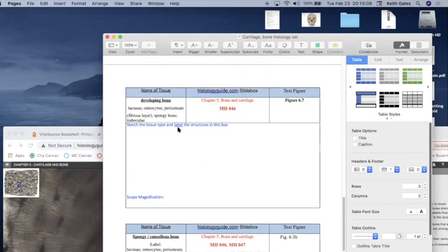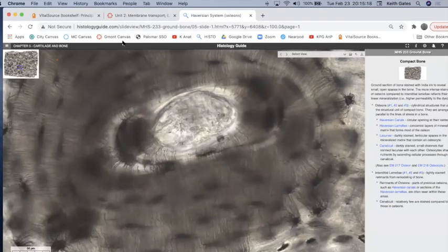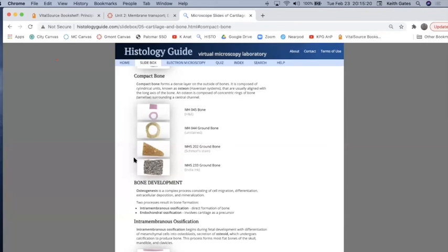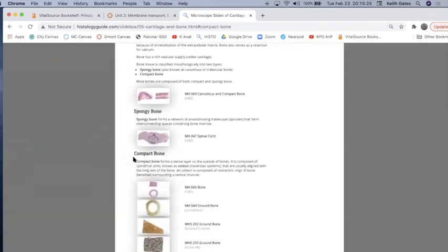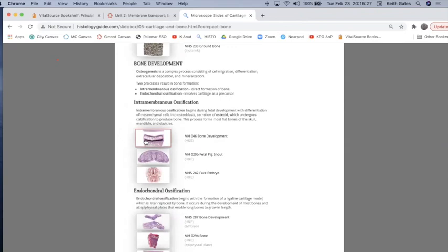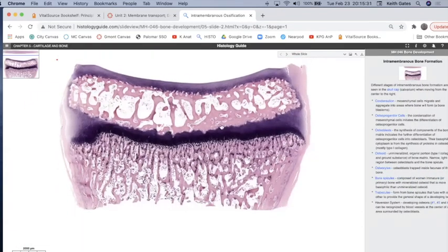And then we have the developing bone, in which we could see these structures here: lacuna, osteocytes, periosteum, spongy bone, trabecula. So that was the one we looked at on the cartilage already. But it has another one with maybe different stuff labeled. Again, this is looking at the actual development, as we'll see. You start off with this cartilage model that's going to be gradually replaced by bone.